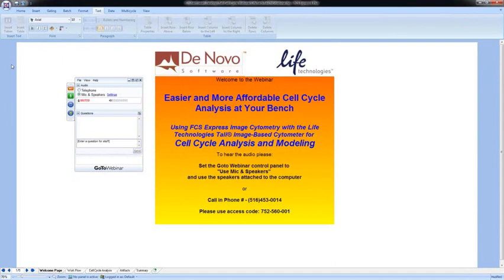Hello everybody. Welcome to the webinar today for easier and more affordable cell cycle analysis at your bench. In particular, we're going to be discussing using FCS Express Image Cytometry with the Life Technologies Tali Image-Based Cytometer. And specifically, we're going to be covering cell cycle analysis and modeling of cell cycle data, acquisition through the Tali, and analysis in FCS Express Image Cytometry.